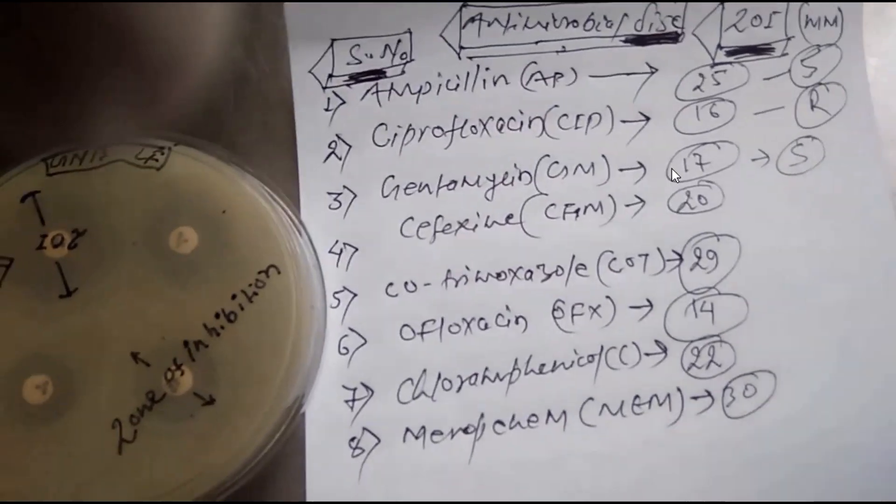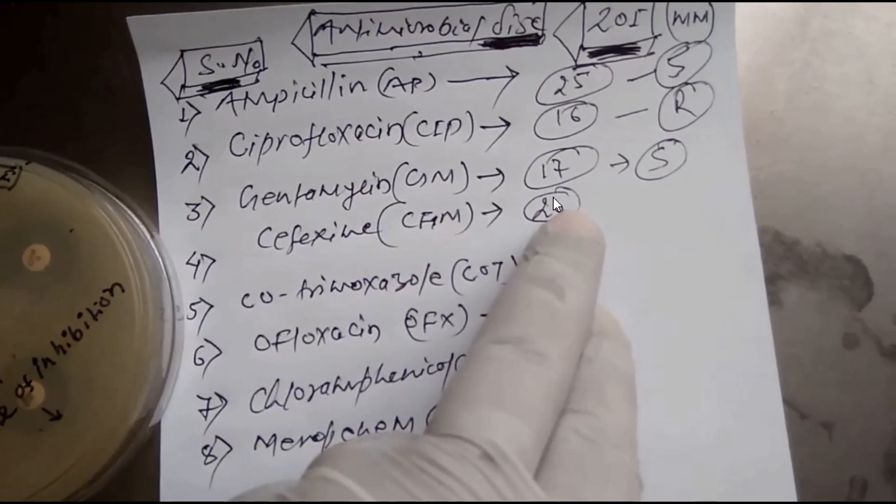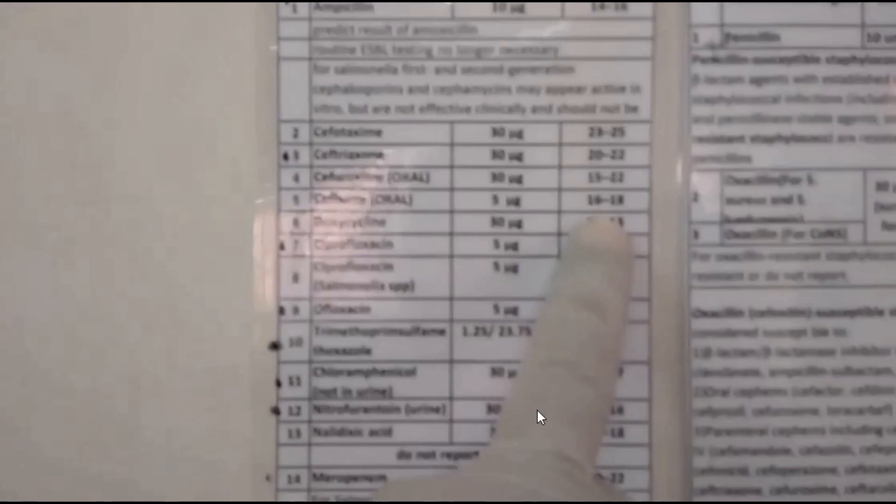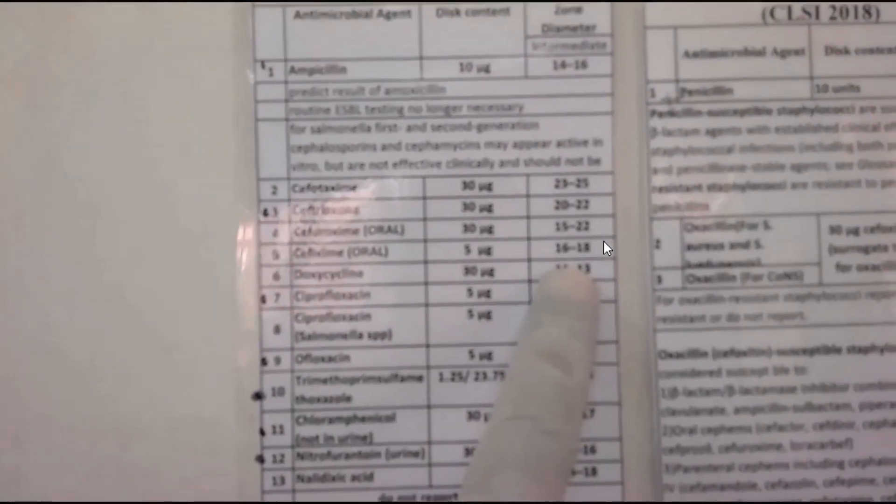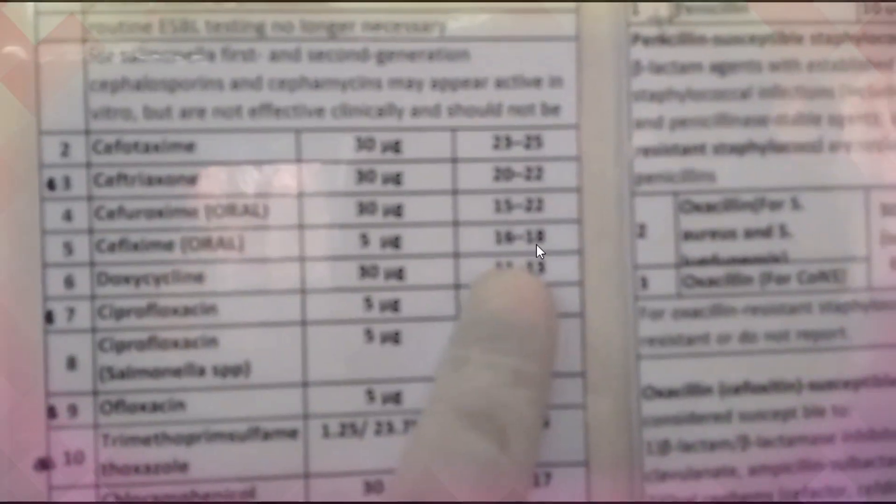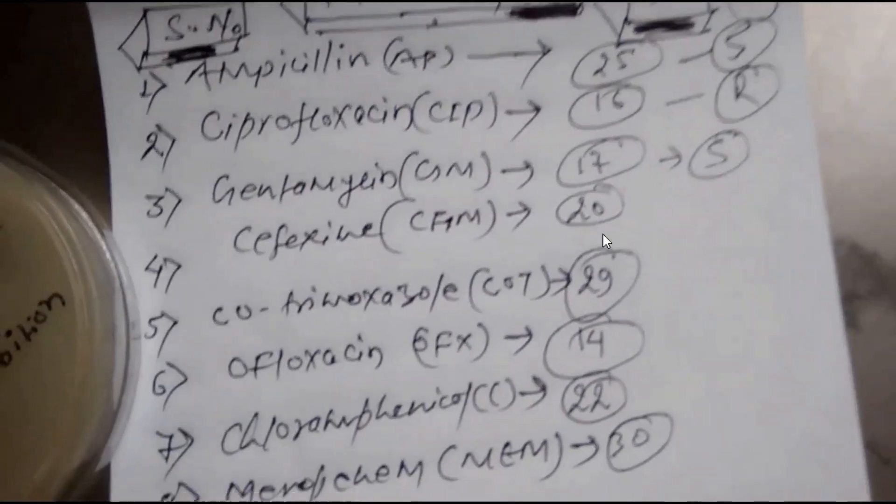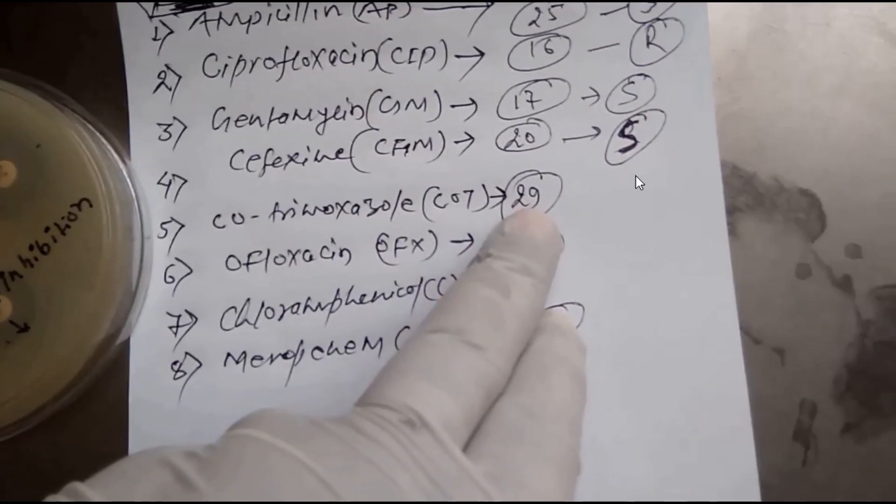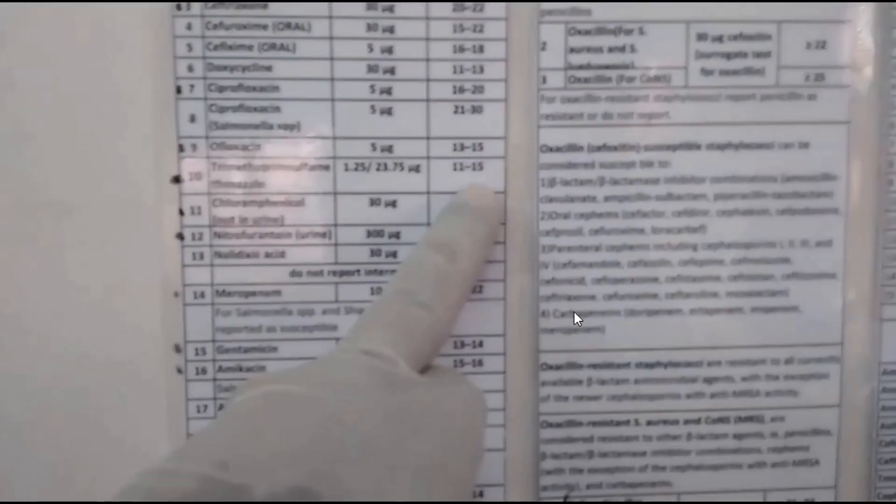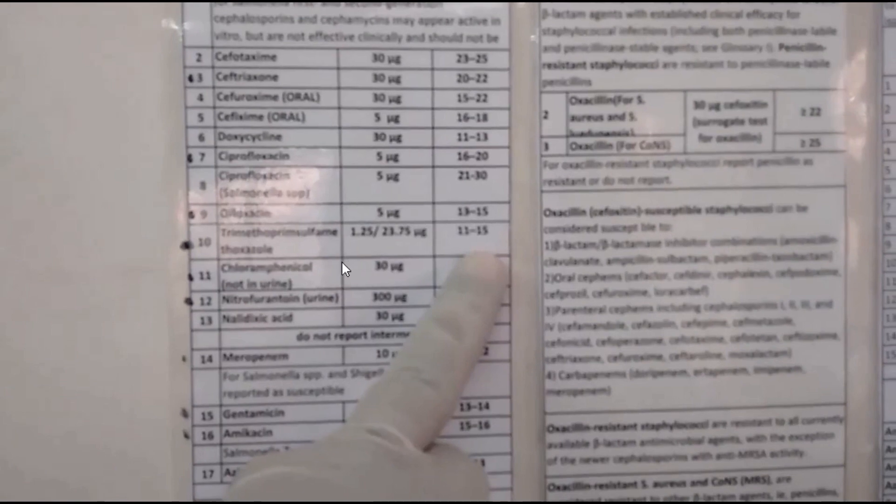Zone of inhibition for Cefixime is 20 mm. Now compare this one with the chart. Here you can see to be sensitive, it must be more than 18, but here we have 20, that's why it's sensitive.